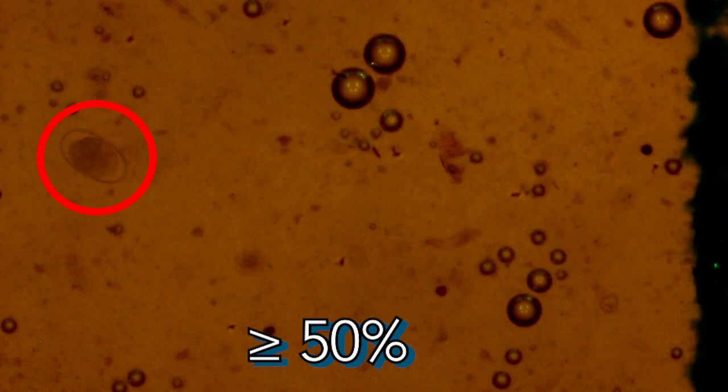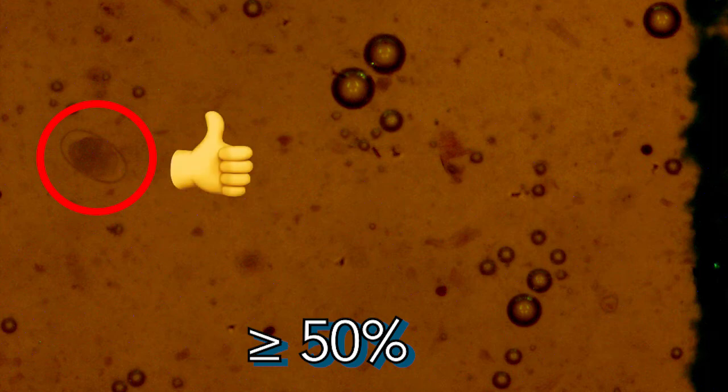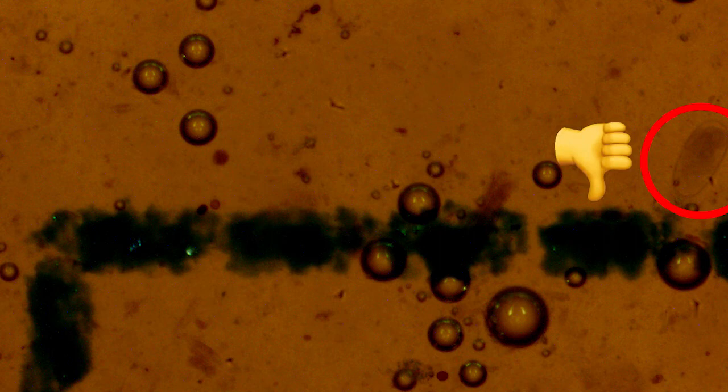Now the eggs that you do want to count would be those that are 50% or more within the grid. If they are right on that line but mostly outside of the grid, do not count them. And make sure to count all eggs inside the grid only once.